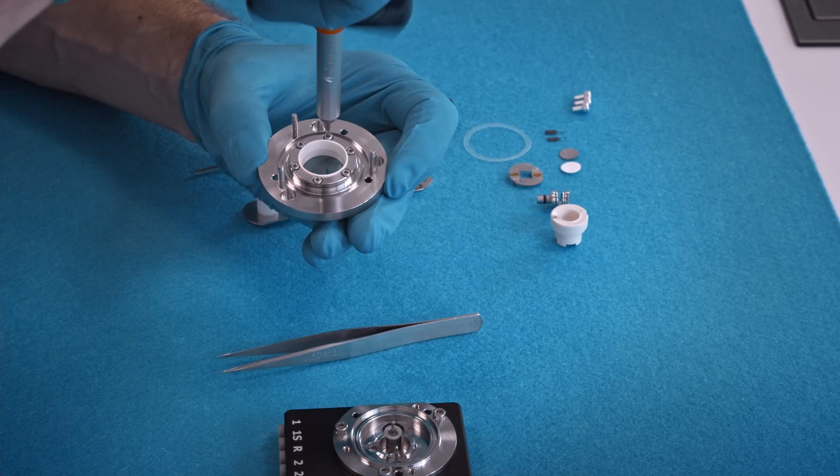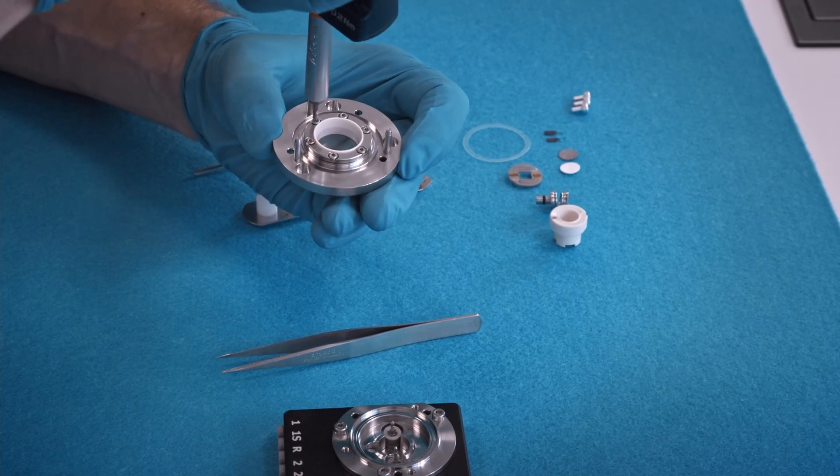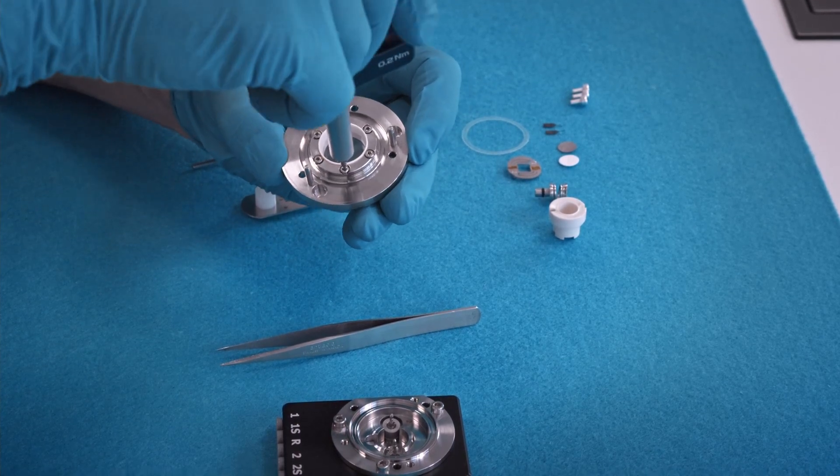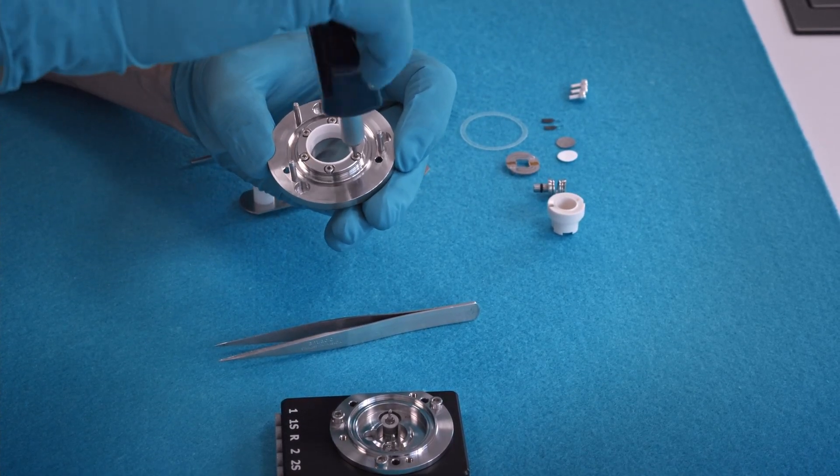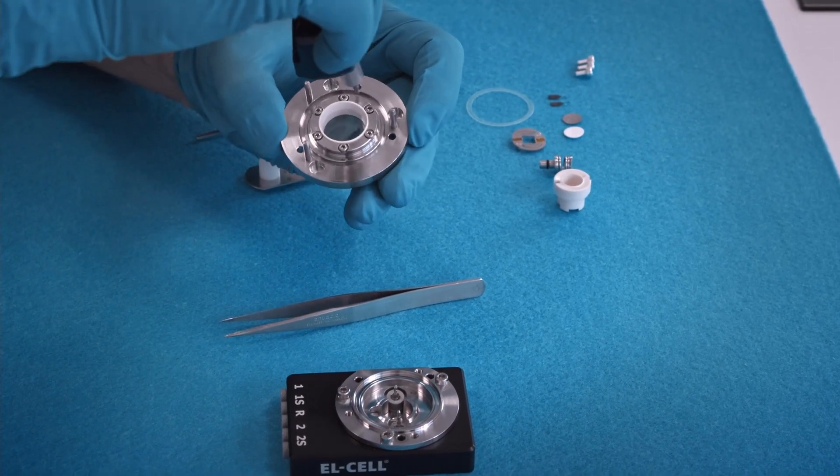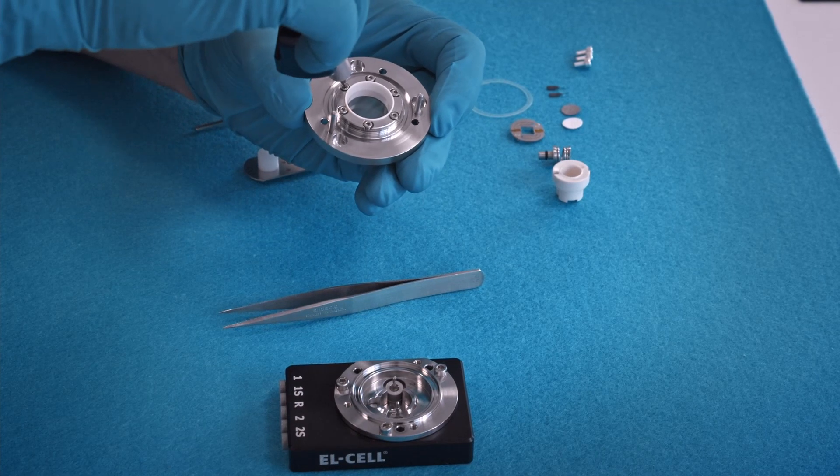And finally, tighten the screws until you hear the wrench click. This is to make sure that you don't break the brittle window.